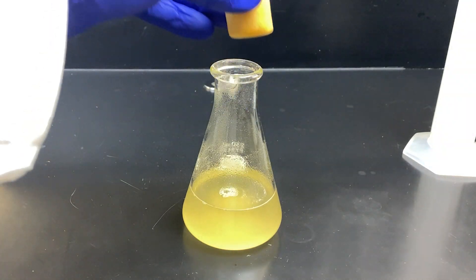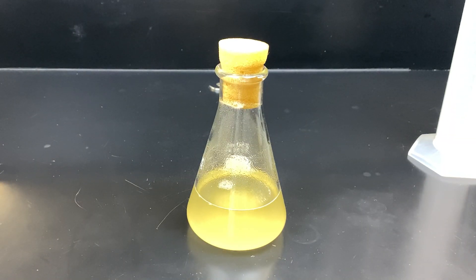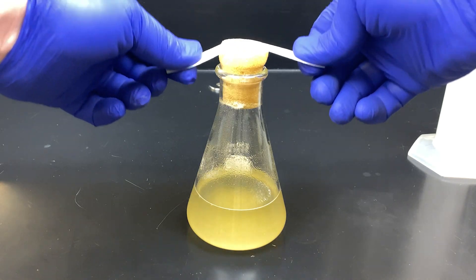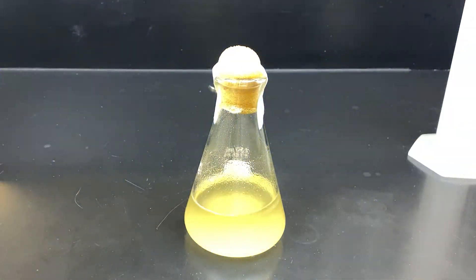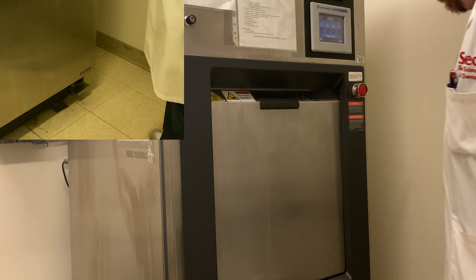We'll cap it with this foam plug — insert the cap into the neck of the Erlenmeyer flask — and use a small piece of autoclave tape to secure it to the glass itself. Don't use too much; autoclave tape is expensive. You can see the autoclave tape has green lines. Under the high pressure and high temperature of the autoclave, the lines will turn black.